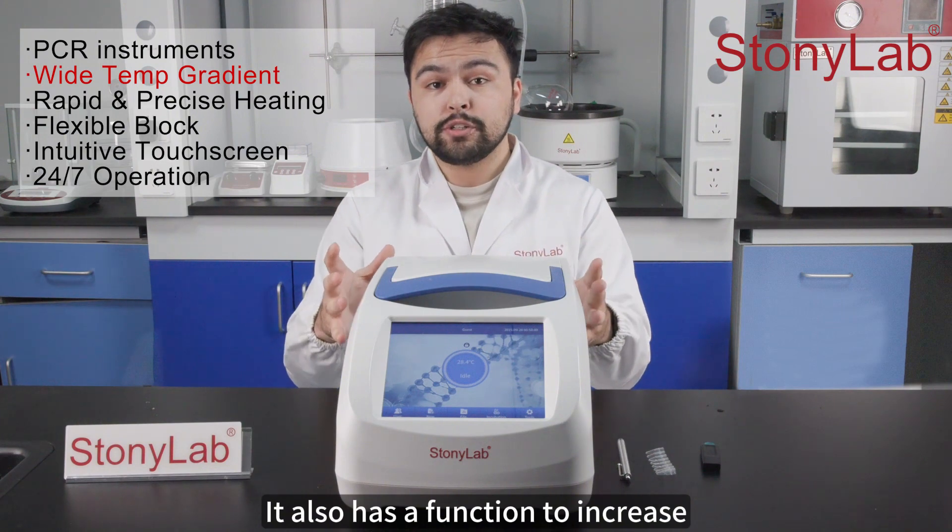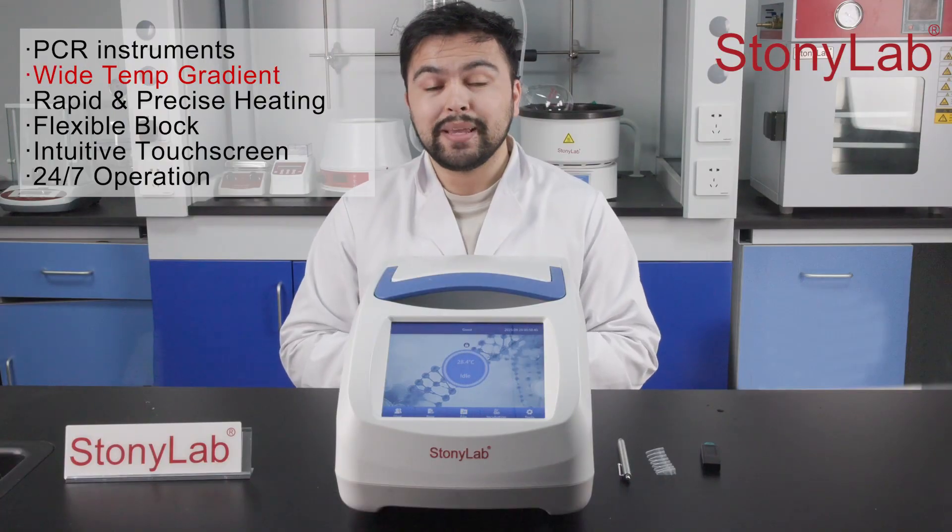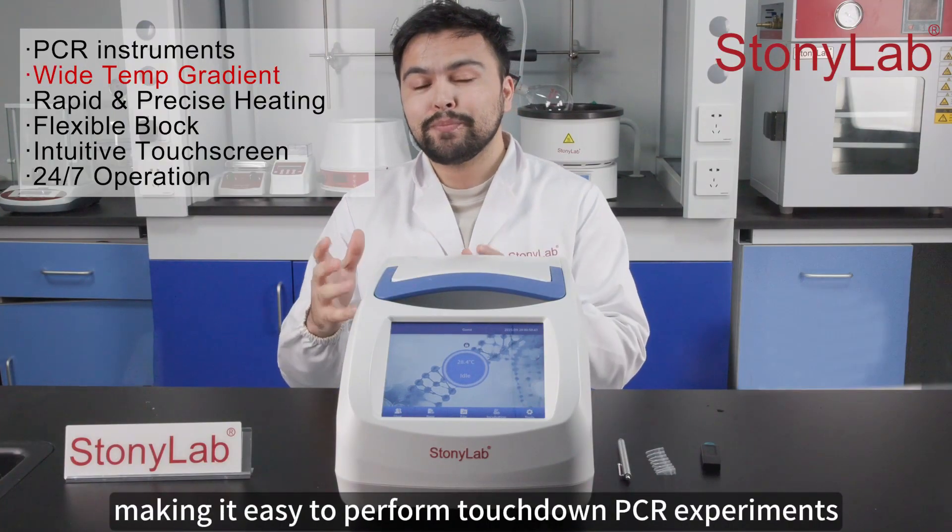It also has a function to increase or decrease the temperature and time for each cycle, making it easy to perform touchdown PCR experiments.